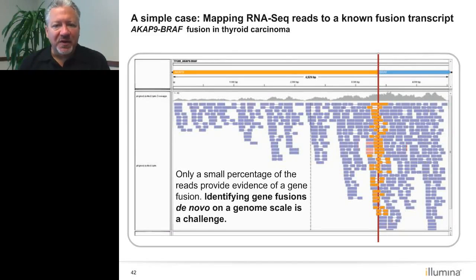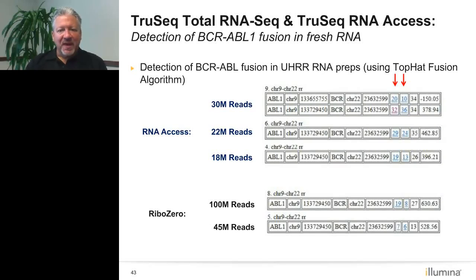So the reason I'm talking about splice junctions is also to point out that you can use the data for alternative splicing, but also to lead into the next topic, which is fusion transcript detection. Obviously, many of the studies where we have these FFPE samples are derived from cancer, and so the point is, can we use this as cancer researchers, even though it's an entirely targeted approach, to also still, quote unquote, discover new fusion transcripts? And it turns out this works remarkably well for that as well.